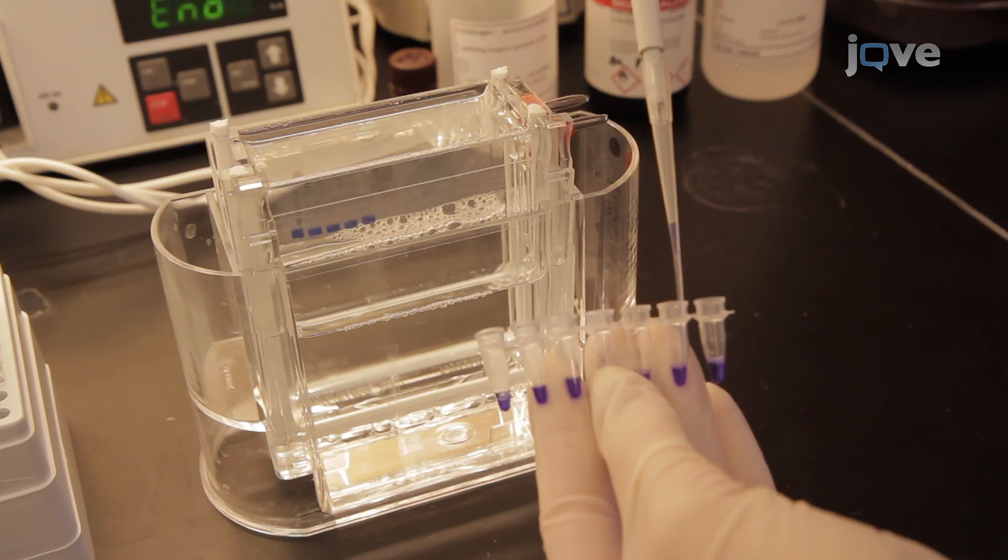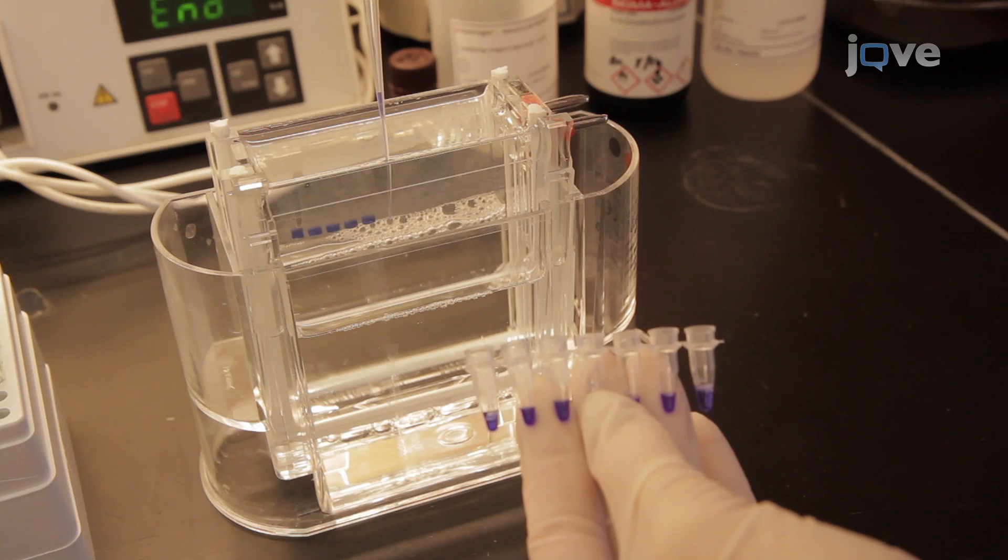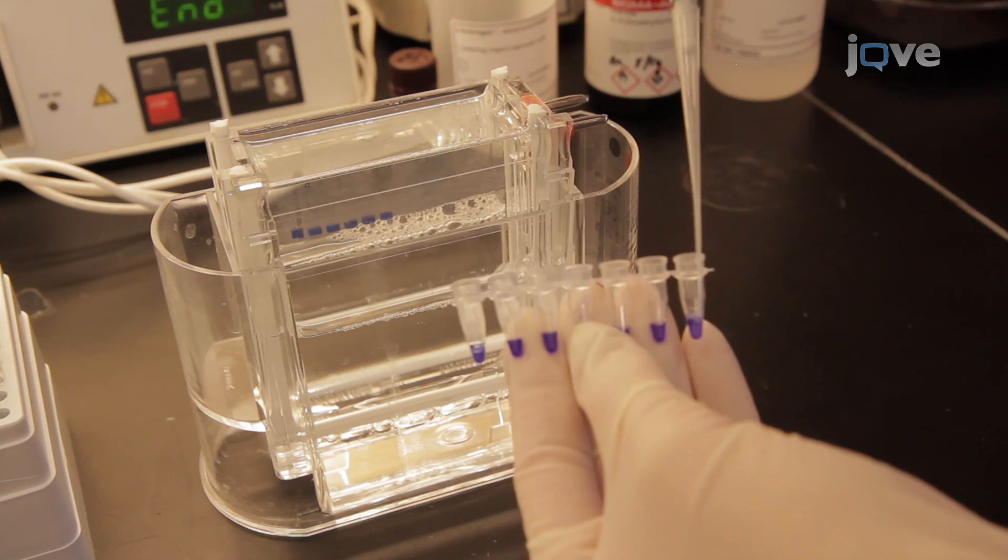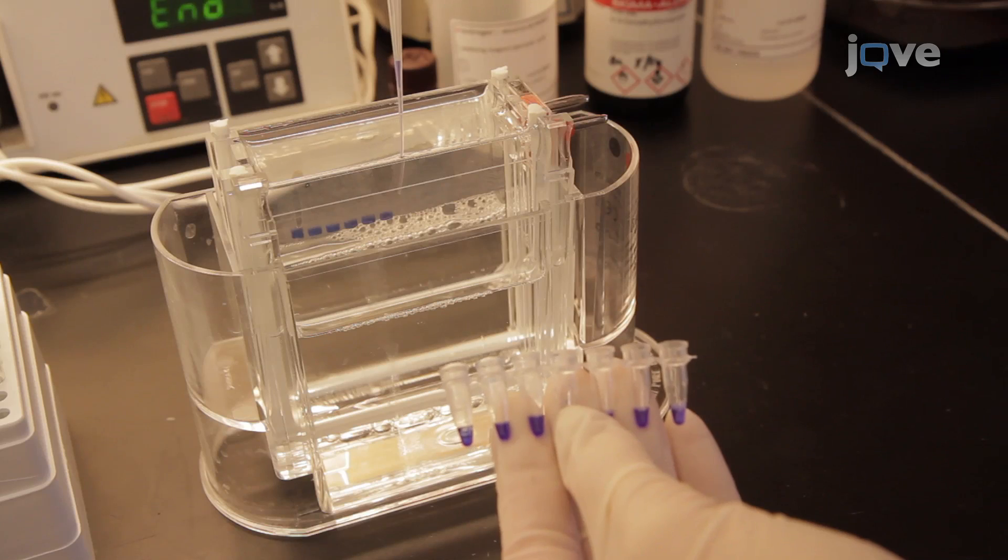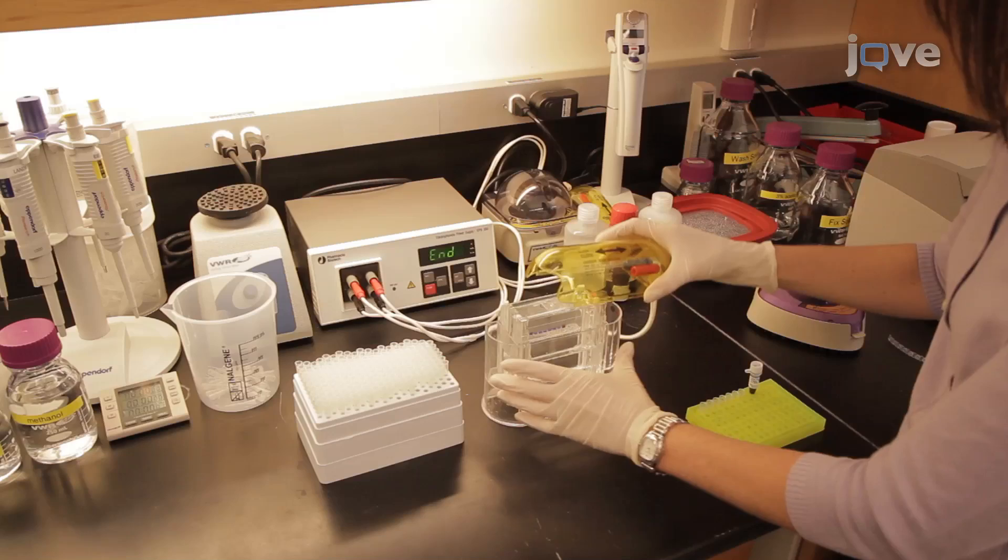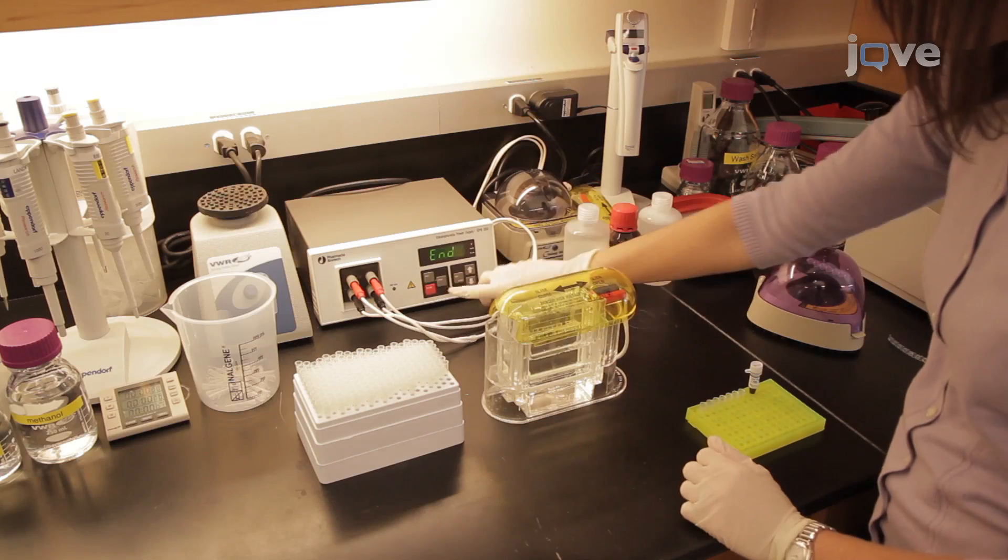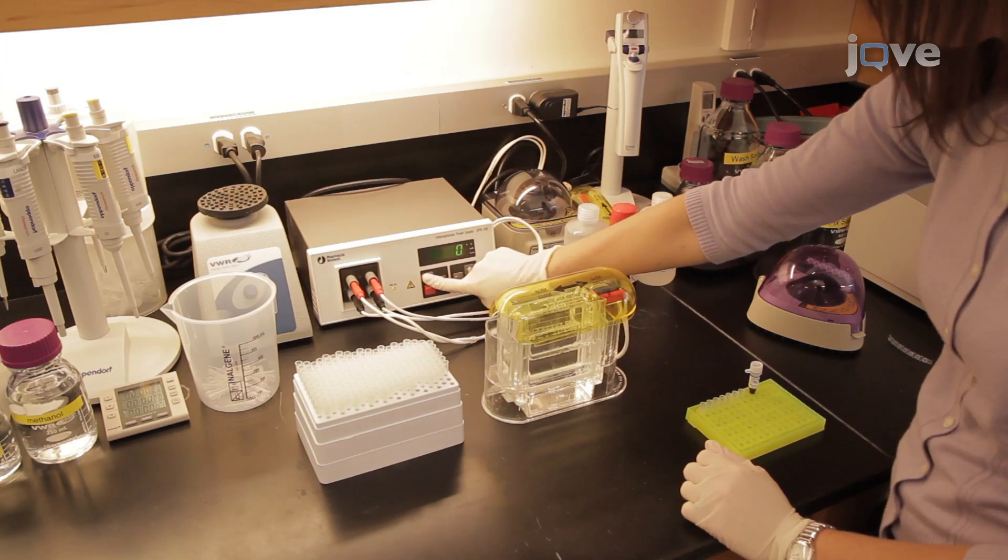Following incubation, load 30 microliters of each sample and 10 microliters of the protein marker on a 10 to 20% trisglycine gel, saving the remainder of each sample. Electrophorese the gel at 130 volts until the dye front is near the bottom of the gel.